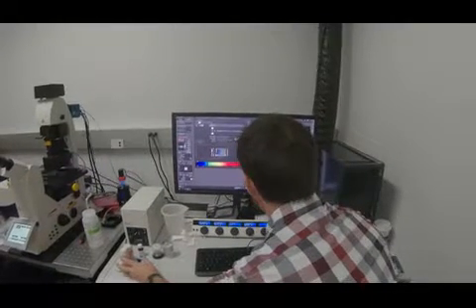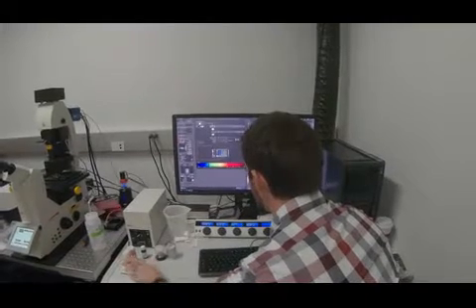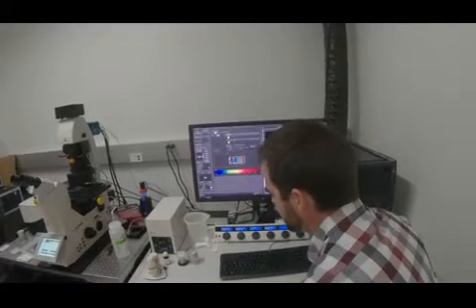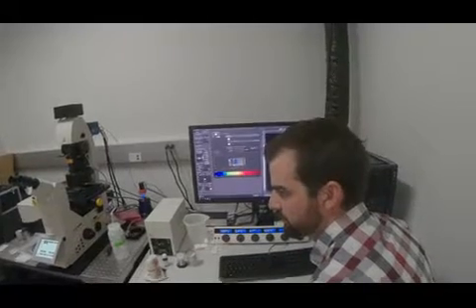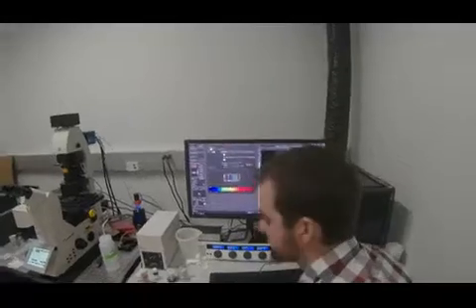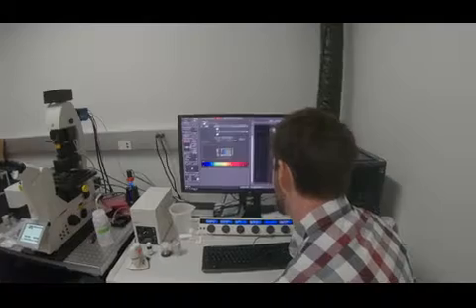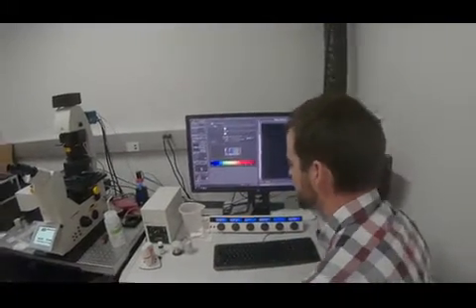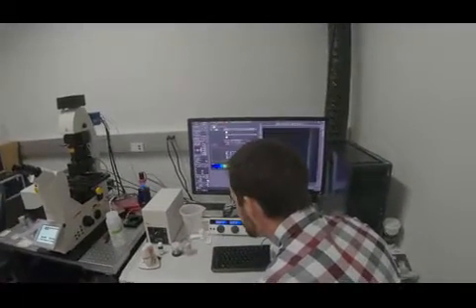And then we can go to other positions and mark those. And then we end up with 3 positions marked, and to be able to get all those positions in view, you need to do a 2x4 and 8 images tiled together. And so I can do this a little bit faster. So do a Z-stack at each position, and then it'll merge them all together.